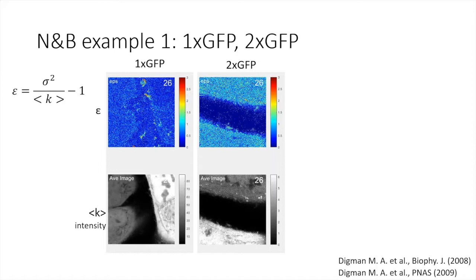For these 3 and these 2, the intensities are different, but their brightness is similar. So this is the way to do the calculation and find out the brightness of your system. And actually, there's another derivation: you can do 2-color imaging and see the interaction, similar to cross correlation, using a similar formula but with 2 colors.